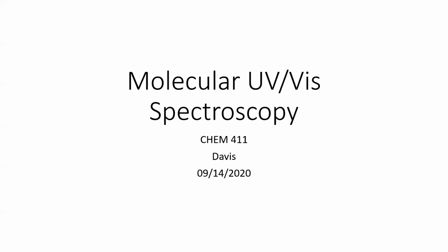All right. So let's get this show on the road. We are in chapter 6 now, and so that is UV vis spectroscopy.